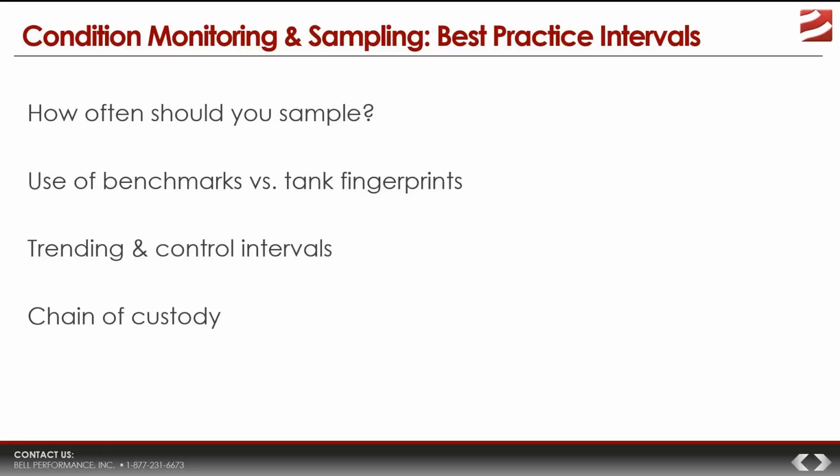But the operative word there is typically, because when you get down to it, every tank environment is different. Every tank in every place across the fruited plain has what we would say has its own fingerprint. That basically means that 10,000 microbial equivalents in this tank over here may not necessarily be as much of a problem as 10,000 over here. It depends on a lot of different things. Now, we use 10,000 as this benchmark because we like to think that it's applicable to the most number of things, and you do have to have a starting point somewhere.